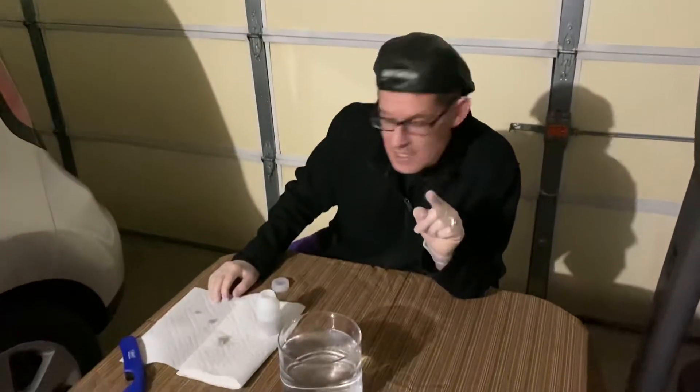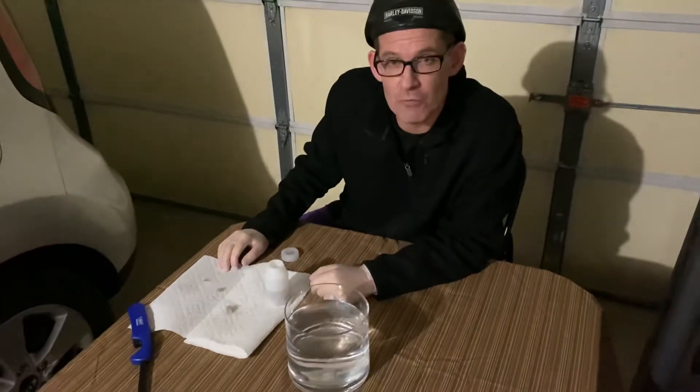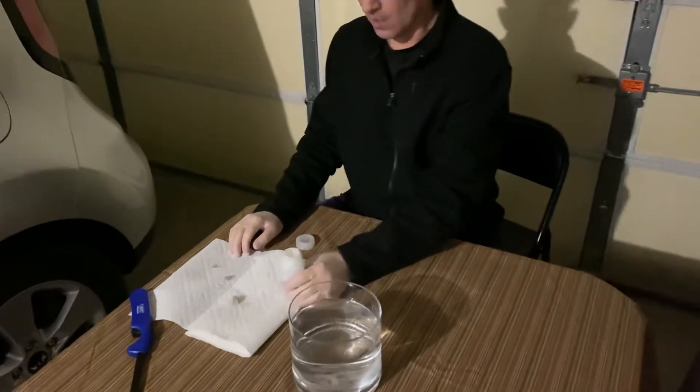Welcome back to Ramseyland. We're really excited — today we're going to perform the single replacement reaction of alkali sodium and water.